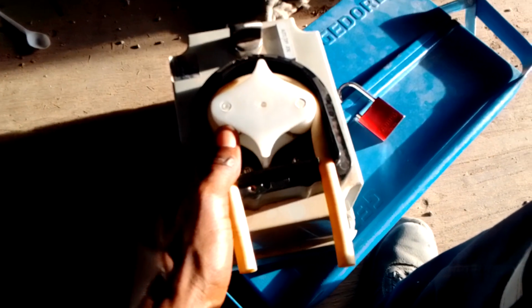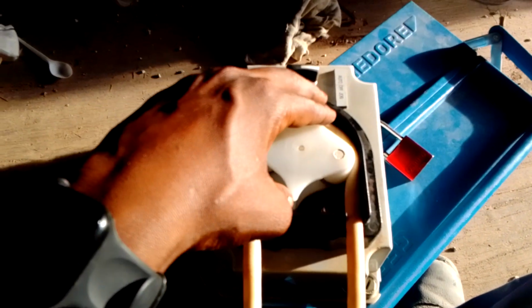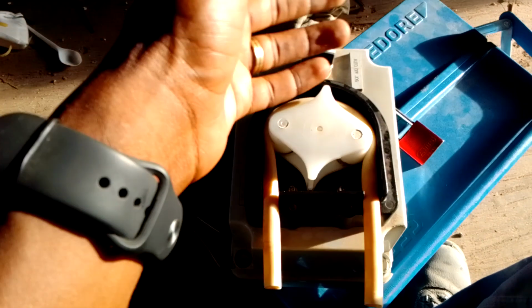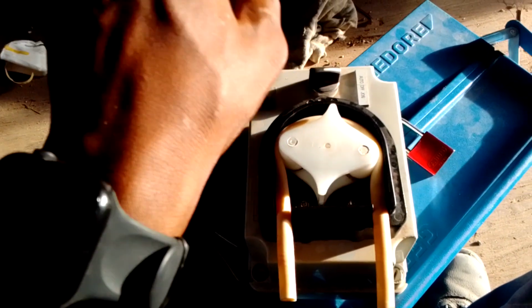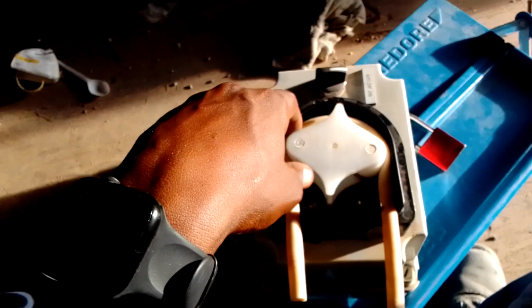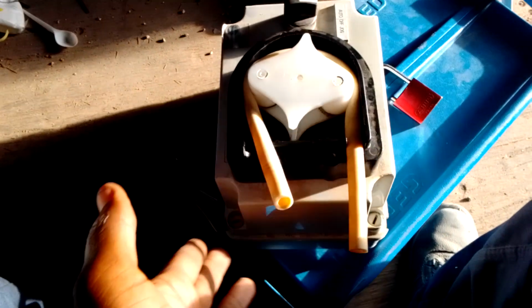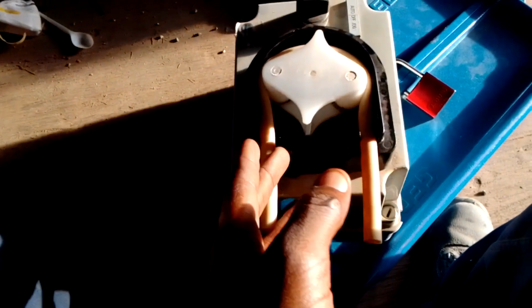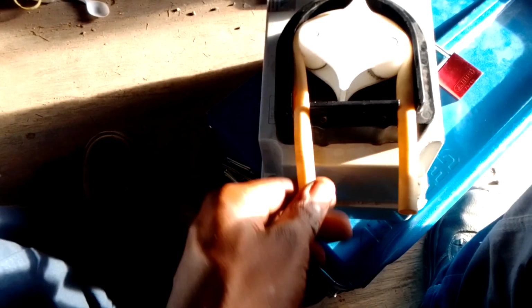Now, this thing, as I called it, a peristaltic pump. If anyone can guess where the name comes from, it comes from peristalsis. If you did a little bit of biology, you'd know that peristalsis is the motion that our intestines use to move the food around our system. So, let's pretend this is our intestine, right? We want food to move through the system. Normally in peristalsis, your intestines are sort of squeezing the food through the pipe, isn't it? Same thing happens with this pump.